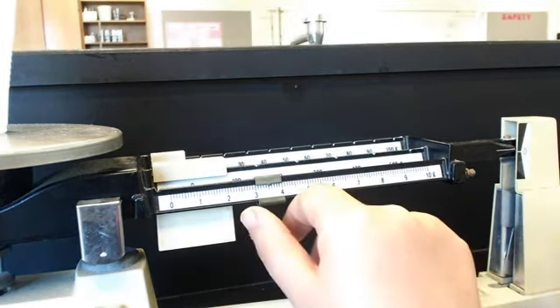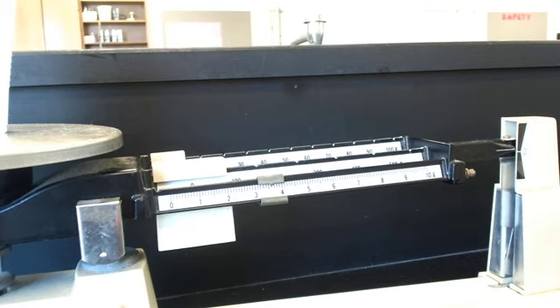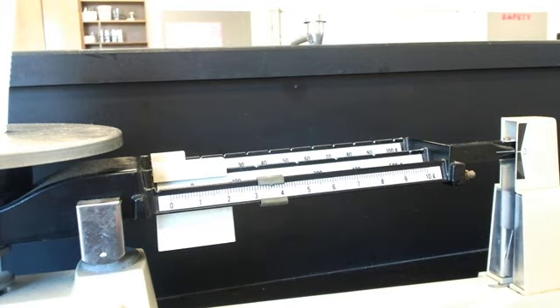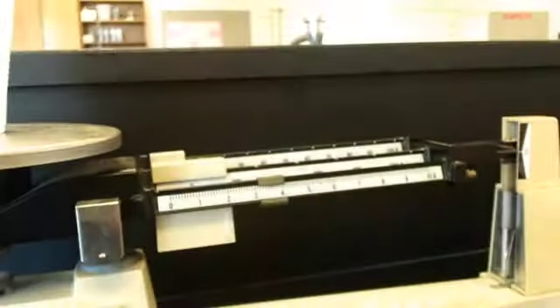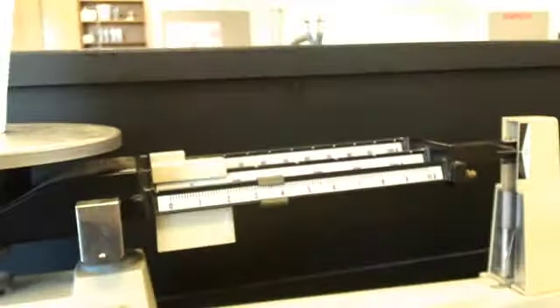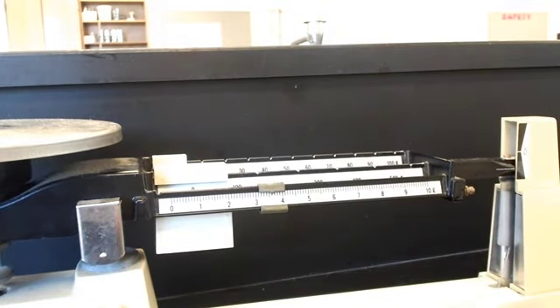So, come up a little bit. All right, so you need to record the mass here, okay? So go ahead and record that mass. Right. Then, that mass goes in each of these boxes for empty cup or beaker, okay? And then mass of 100 beads. So I'm going to start with my small group. Okay.